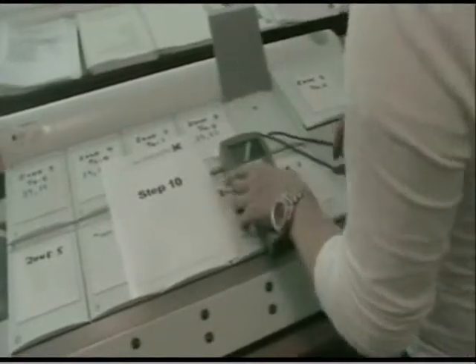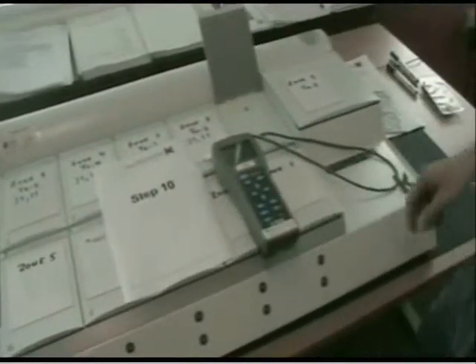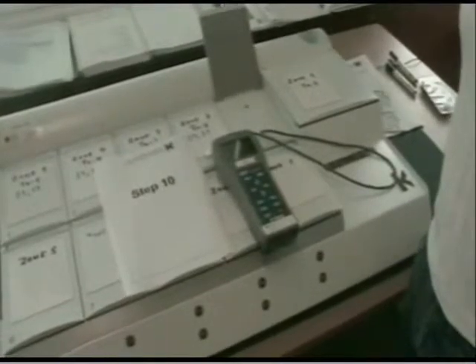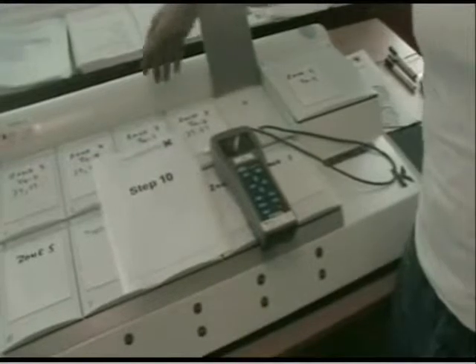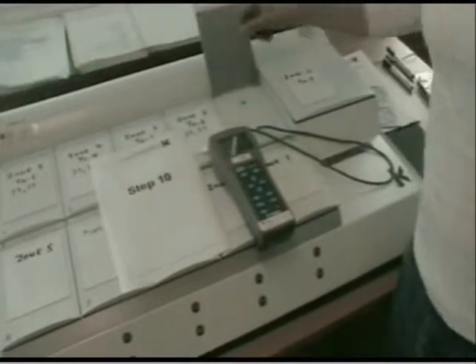Then we wait until the temperature has stabilized and we write down the value on the magnetic lid again. Then we repeat the process over zone 2, 3, 4 and 5, just like we did the first time.